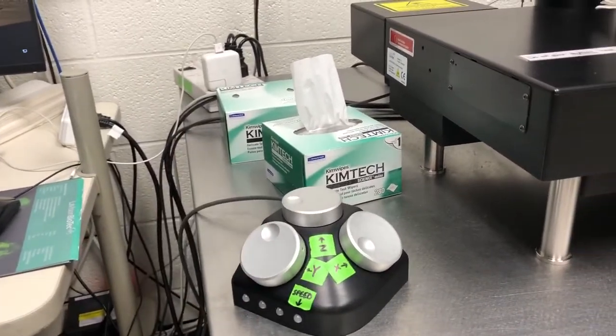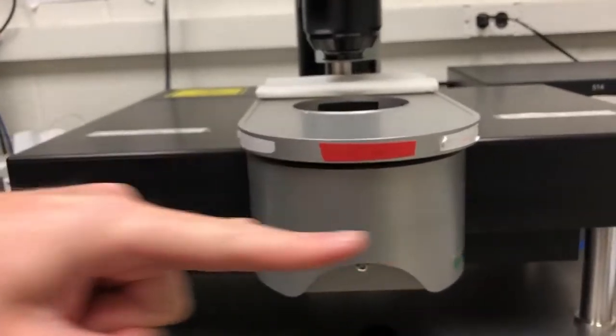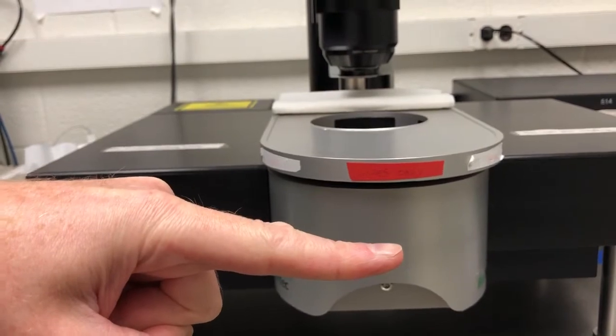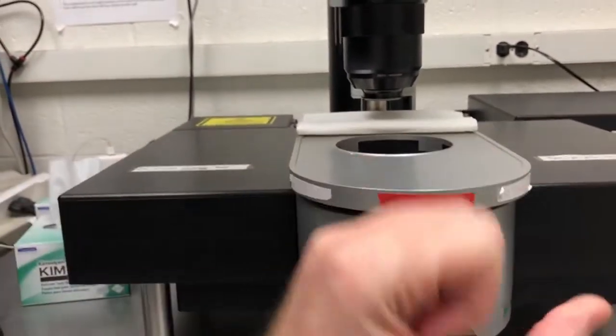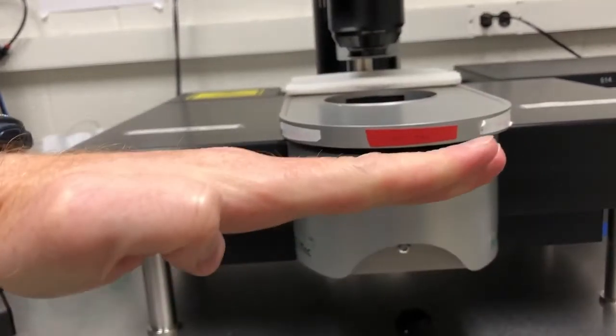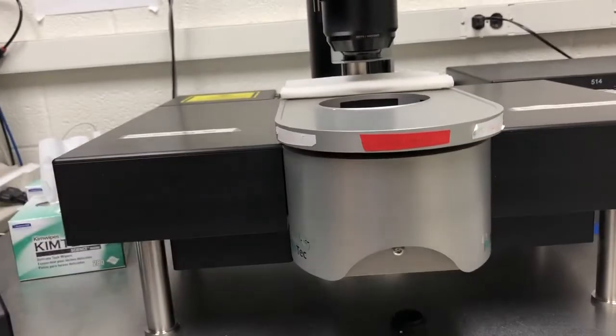We have a joystick that allows us to move the sample up or down. That is the way that we look at different planes, because if you recall, the light sheet will be roughly at this height in the microscope. The way we look at different parts of the sample is not by moving the light sheet, but by moving the sample itself. We can move it up or down while the light sheet remains in the same place, and that's how we get a Z-stack.